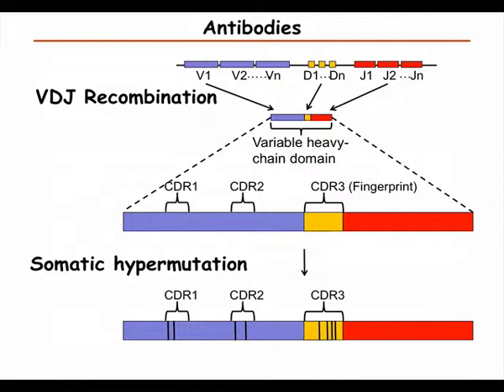Either good antibodies against a few tags like protein A and green fluorescent protein, or against the proteins themselves. So one thing that one wants to be able to do is to generate antibodies easily. And one way to generate antibodies is if we can sequence them.